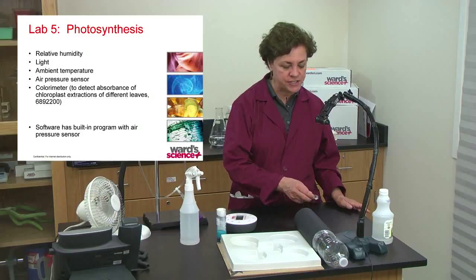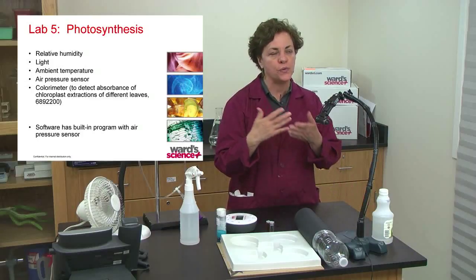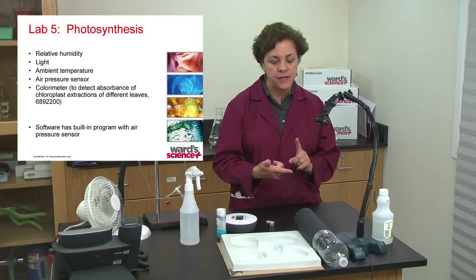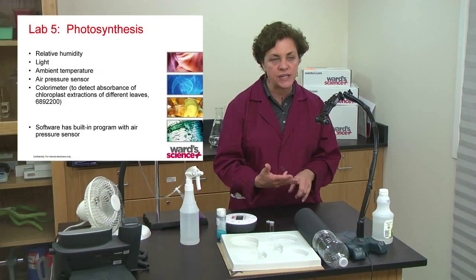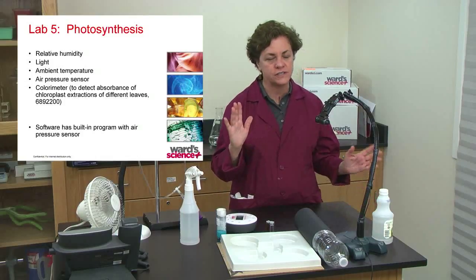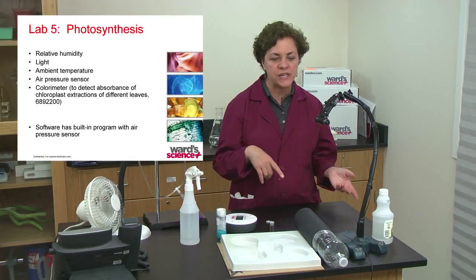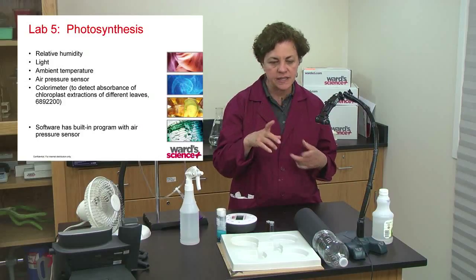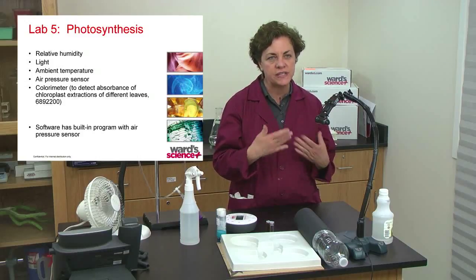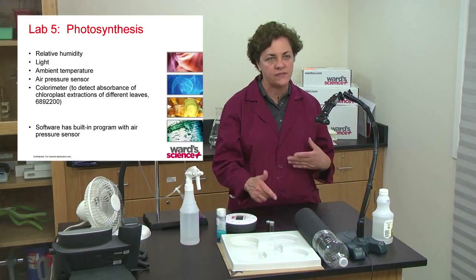Colorimeter, you're going to do the same thing we just did with the enzyme one, except you could make an extract of red leaf cabbage versus green leaf cabbage and see what the difference is on the blue, the red, and the green wavelengths. I tested this with blue food coloring just for fun, and the only one that was really different between blue and clear in a big way was the red, which makes sense because the red is going to read the blue differently. The blue is not necessarily going to be picked up with the blue wavelength because it reflects.